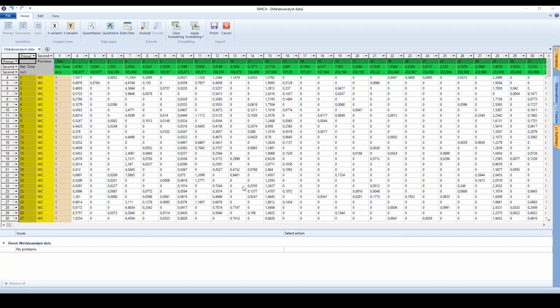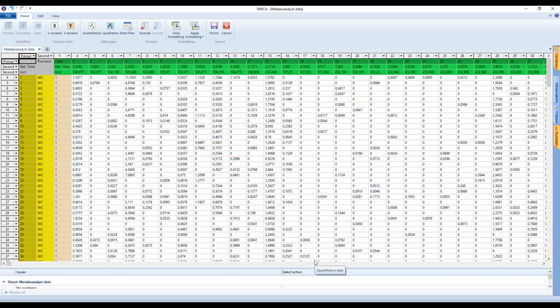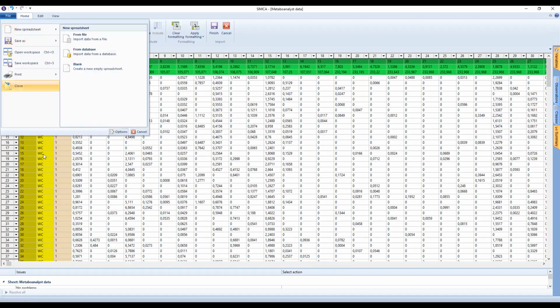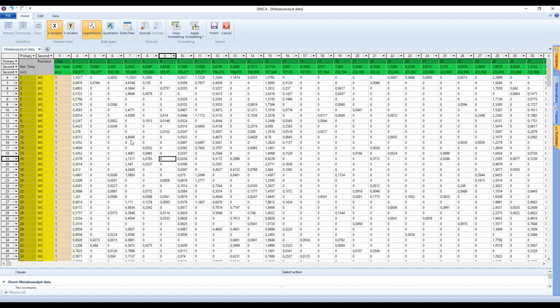Okay, I've used a different example to illustrate OPLS. In this case, once again, this is LCMS data. We can do exactly the same with GCMS. The pre-processing is the same, and then you just bring your data matrix into Simca software by bringing in a new project, and then you import it into the software.